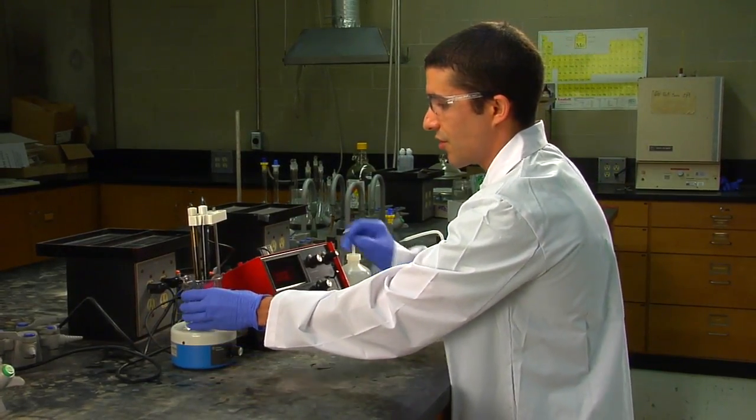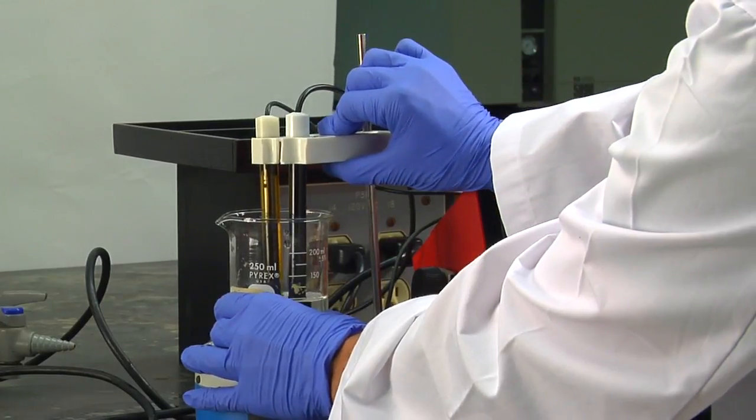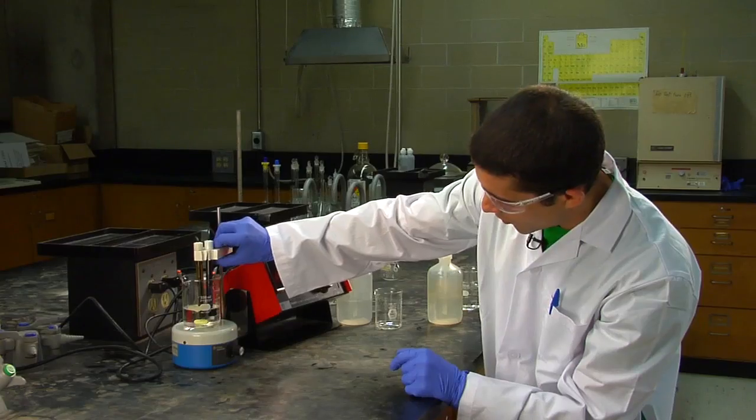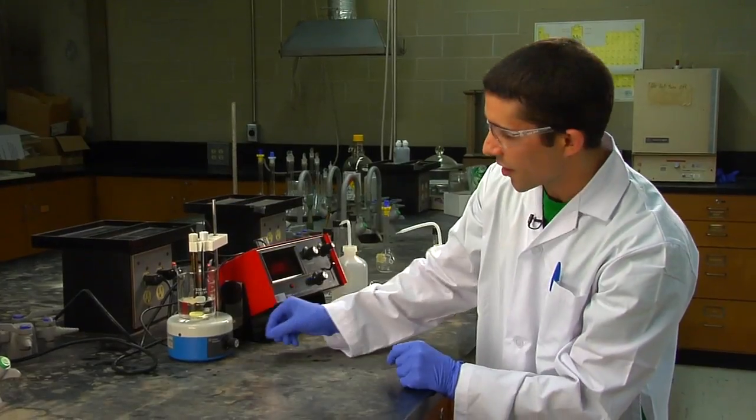You can then place in your sample, and you can lower the electrodes, not too far that you hit the magnetic stirrer.